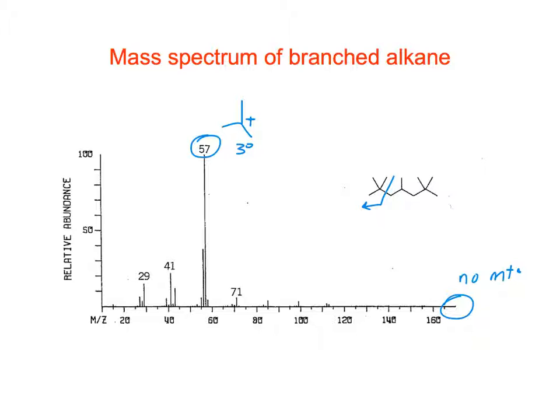And it can happen on either end, and we're losing a large mass. Would it happen at either end at the same time? Like, would one molecule split? No. It doesn't get cleaved into two chunks? No, usually these reactions are what we call unimolecular reactions. We're in a vacuum, so we don't see, in EI, bimolecular reactions between molecules.